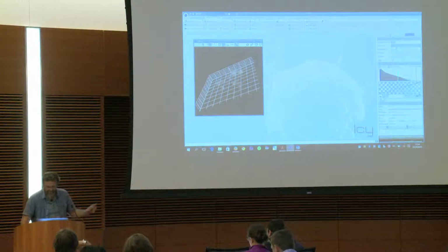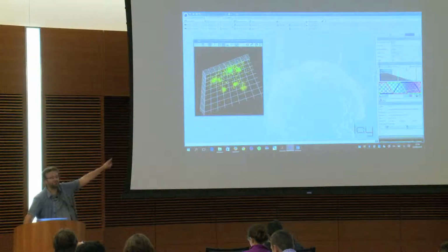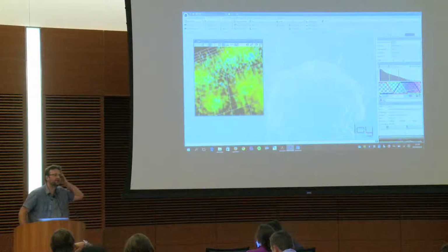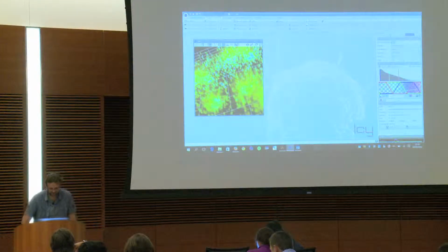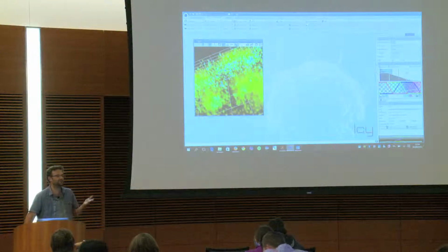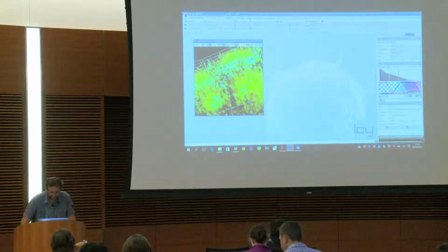Oh yeah, it's because I'm connected to the screen. We are using the VTK, so it doesn't react the same if you are connected to a beamer or not, because it's not using the video card the same way. So here I'm completely on the CPU for the rendering. And this is a raycasting rendering, meaning that it considers the transparency of your environment to propagate the illumination. And you see that the lookup tables that you have in 2D are consistent with the viewer that you have in 3D. It may not mean a lot, but it was a little bit difficult to do.